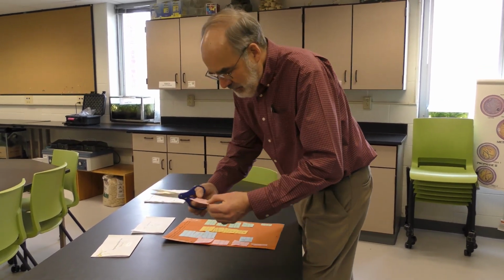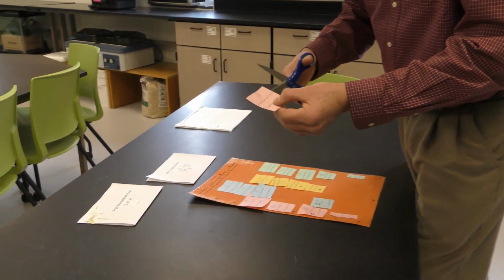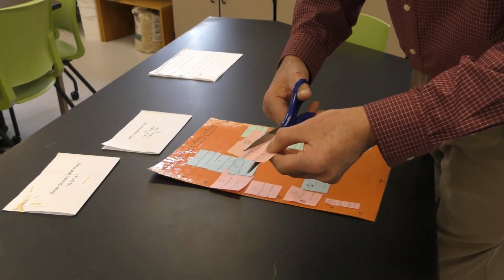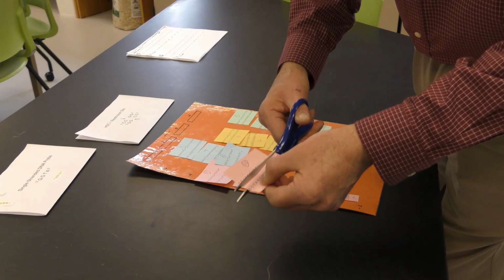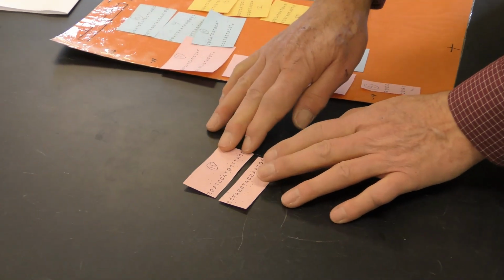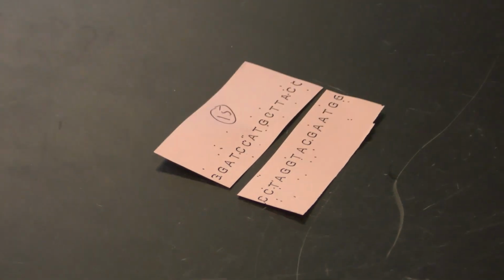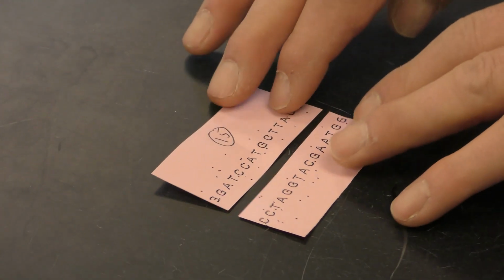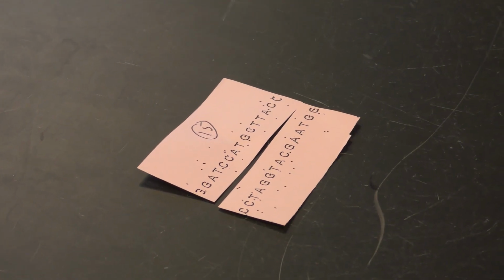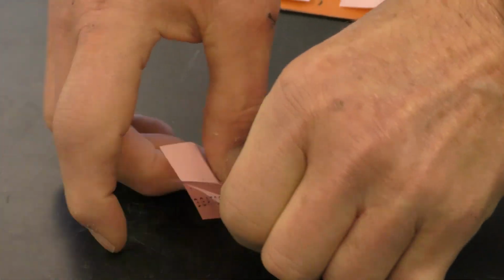double-stranded fragment. And to model this in this exercise, you would simply take your scissors. Essentially, the first step of the Southern blot is to do this. You create single-stranded fragments from each double-stranded piece, okay? By simply exposing them to very high basic sodium hydroxide, very high pHs. The DNA strands will separate from each other into single strands.